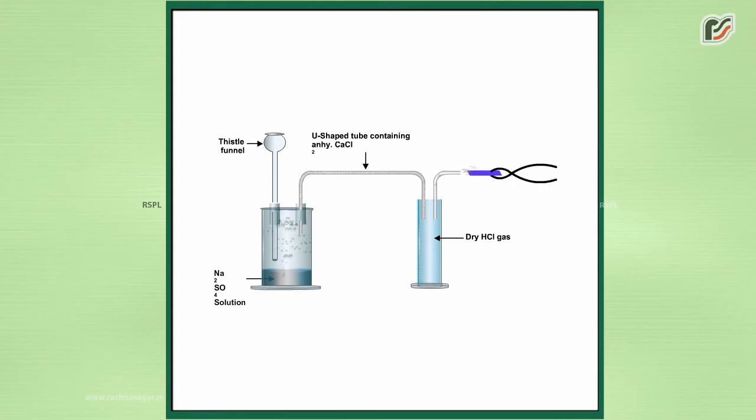Test it with moist blue litmus paper. Add benzene into this jar to dissolve the HCl gas. Test it with dry blue litmus paper.